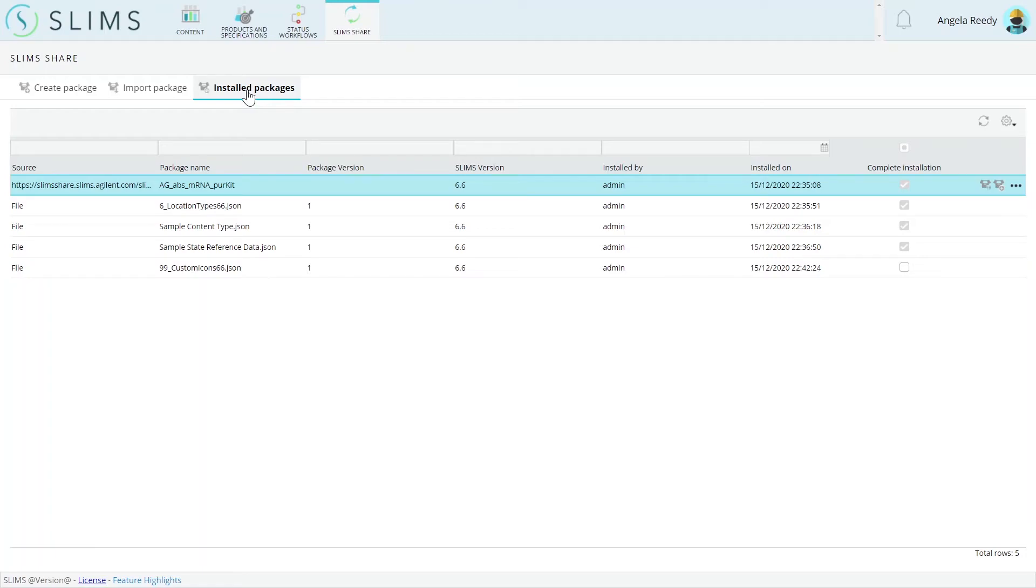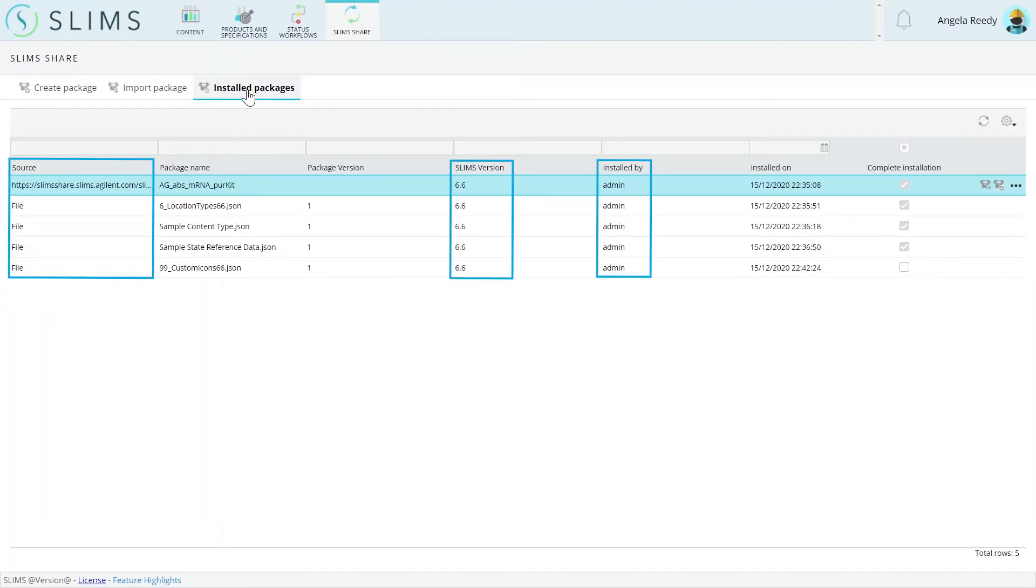The Installed Packages tab exposes details about packages that were already installed, so you can see where they came from, who installed them, what the package version was, and whether they were completely installed.